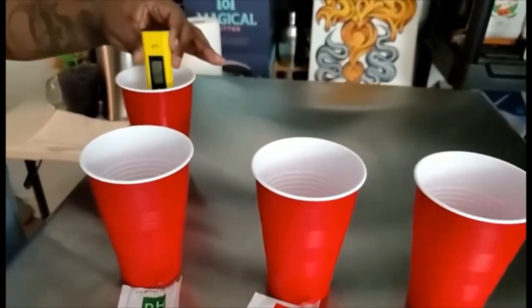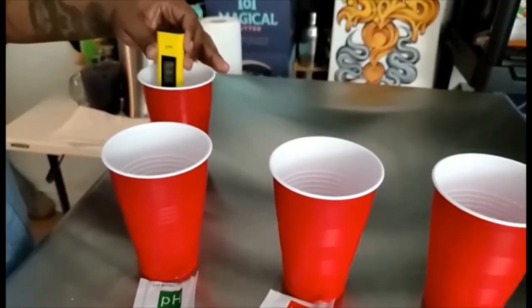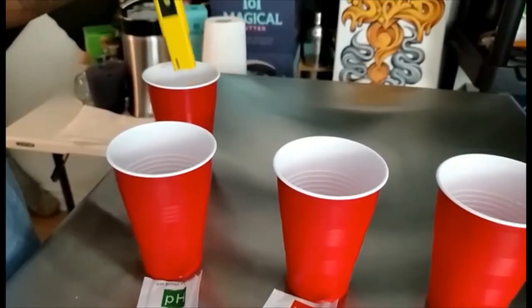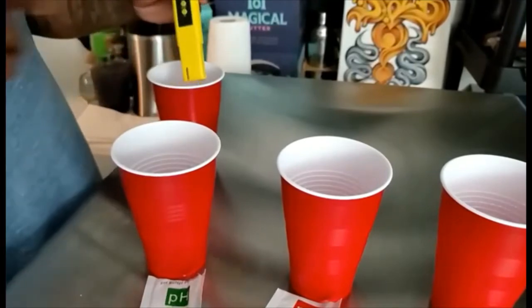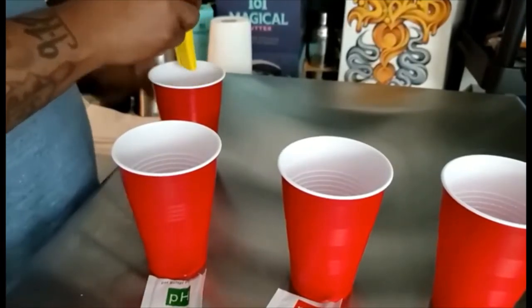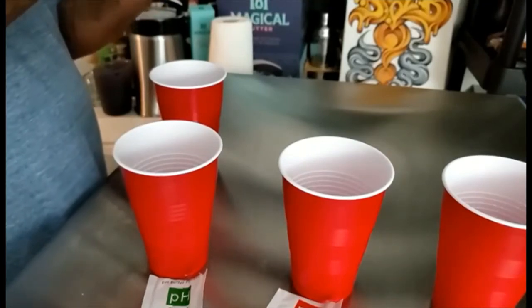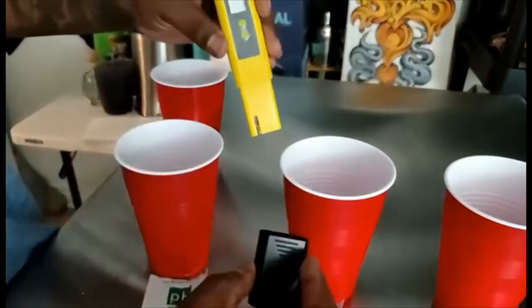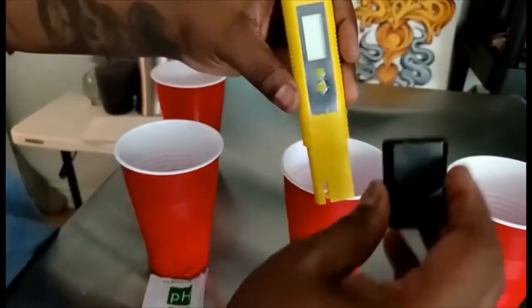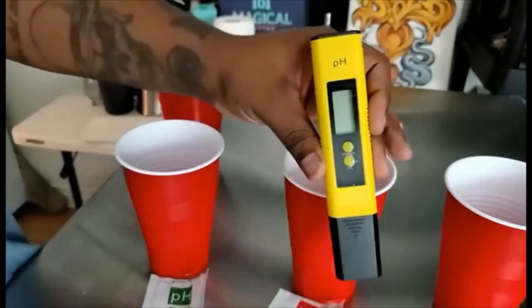Your pH tester is now calibrated and ready to go. As growers, whether you've been growing for one day or longer, you need to have your pH tester calibrated so it gives you the right reading. If you don't, there's a big chance your plants are going to be nitrogen deficient or have other deficiencies because your pH level is not correct.